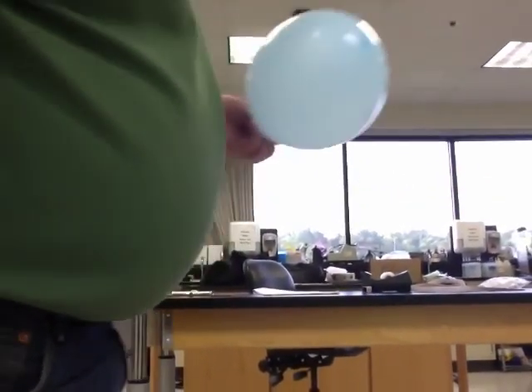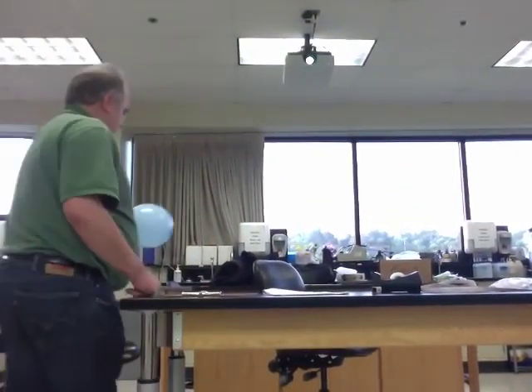Now we're going to measure the diameter. Okay, so it's about 61. Record.